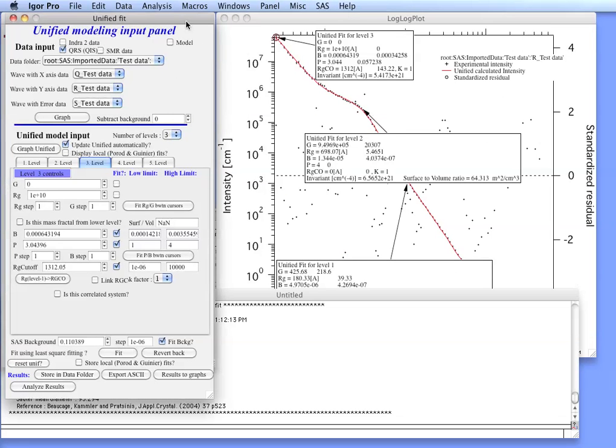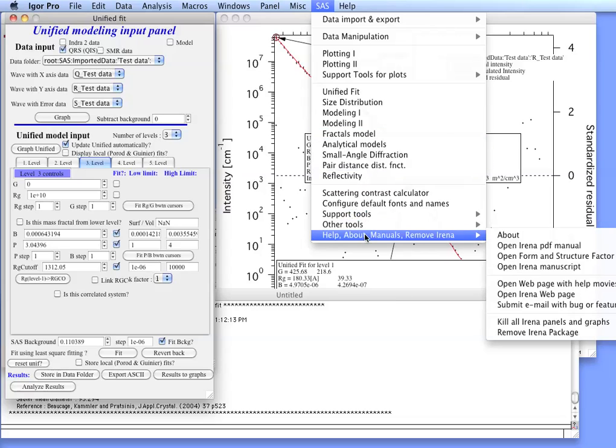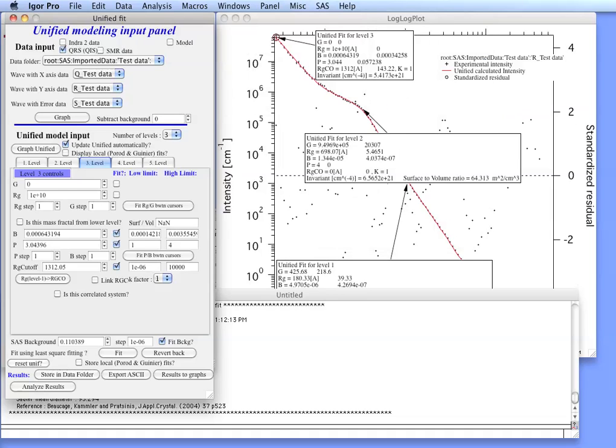For more details, please read the manual, which is available to you directly from the menu. And there is an Open IRENA PDF Manual from which you can actually find more details than were described here.